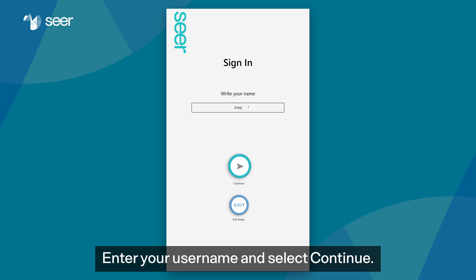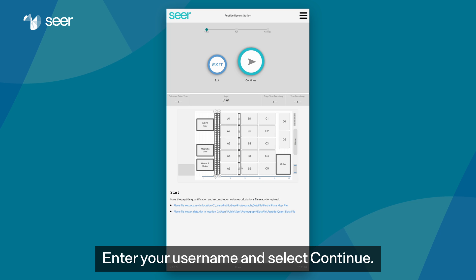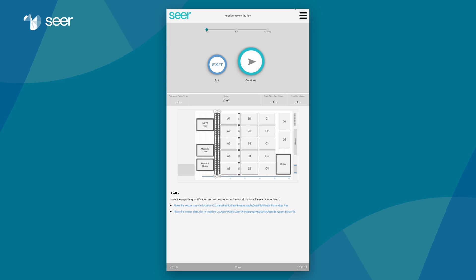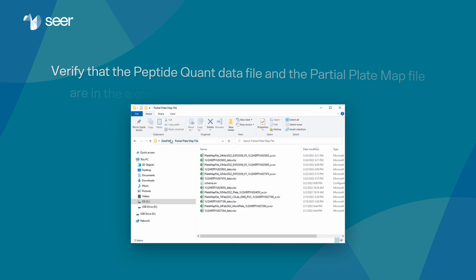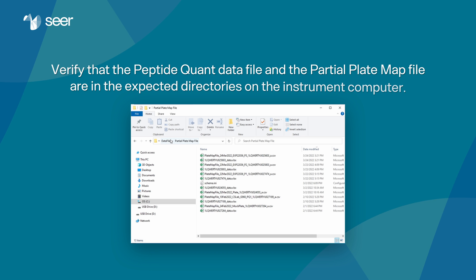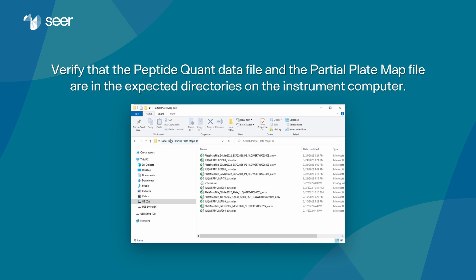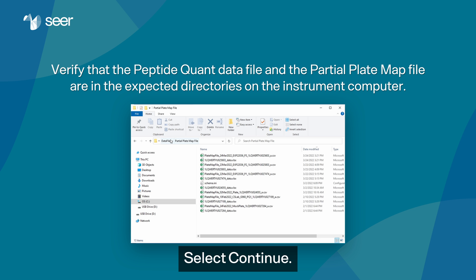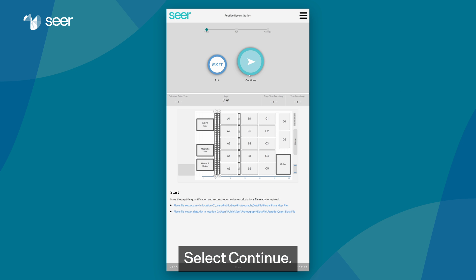Enter your username and select continue. Verify that the peptide quant data file and the partial plate map file are in the expected directories on the instrument computer. Select continue.